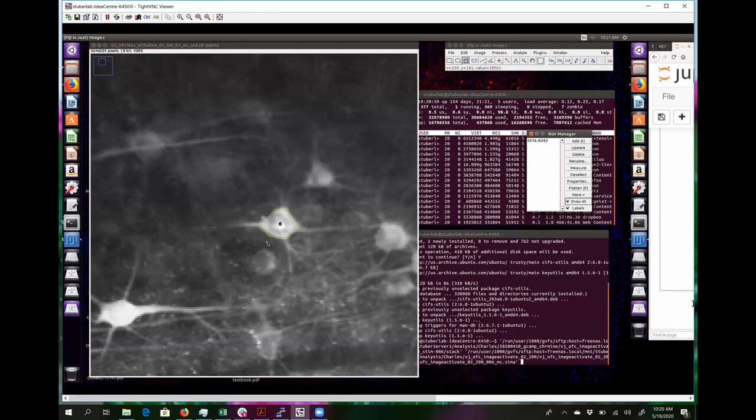If you see that, where suddenly the cell becomes quiet and then suddenly the cell becomes active again, it's likely motion. So that's basically the issue with drawing the ROI covering the entire cell like this. Now, of course, you can say, well, I'm going to correct the motion perfectly. And that's fine. If you're actually able to correct the motion perfectly, then that's fine. But you have to ensure then that literally not even one pixel is moving in your image in any frame.